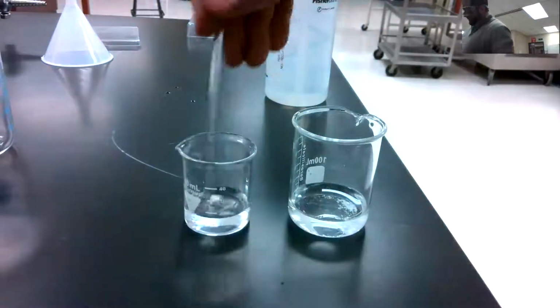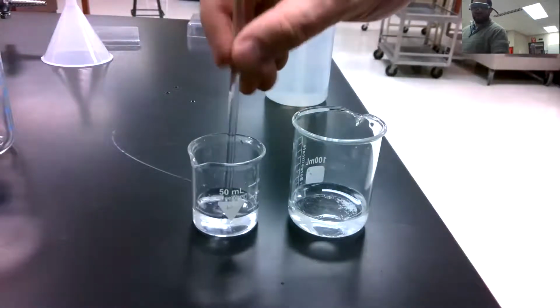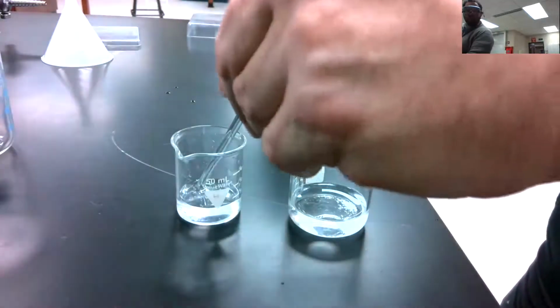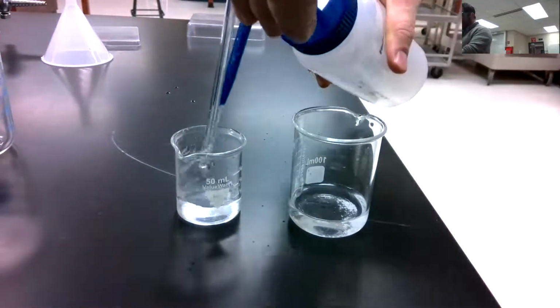The little beaker, that one dissolved quickly. I don't know if you can tell. Probably tough to tell, but you can't really see any salt in this one. So that one dissolved very quickly. And that should help your states of matter when you're writing your balanced chemical equation. What state of matter do we put when we say it is dissolved? You should know.